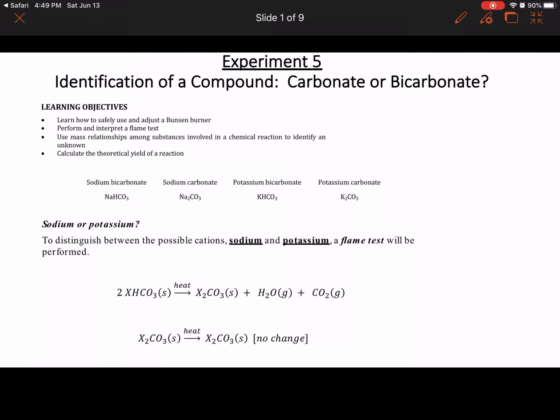Basically, it's the same concept that you see when you watch fireworks. In fireworks, you see different colors, like purple, which means violet, that means you have potassium in it. And if the color of the fireworks is yellow, that is a sodium containing compound. You can have red, and red could be due to lithium and strontium, and then you can see a beautiful blue-green color, and that is due to copper.